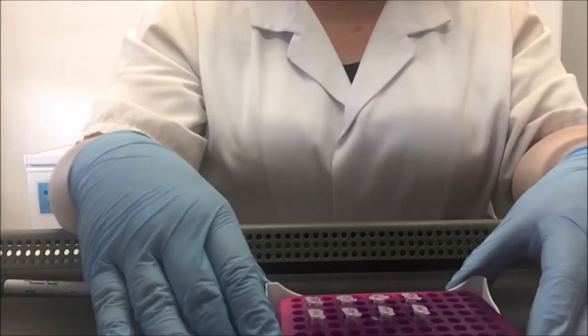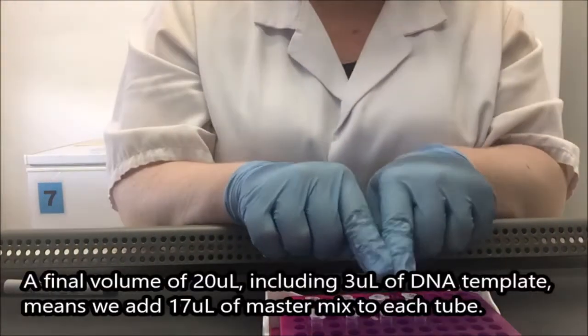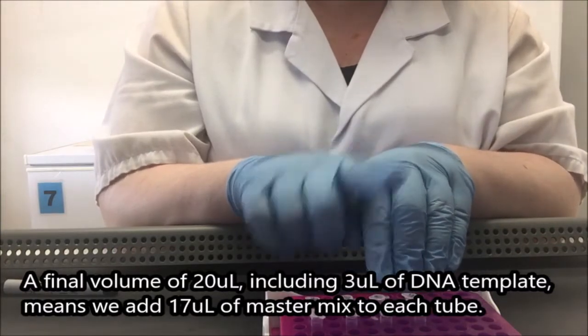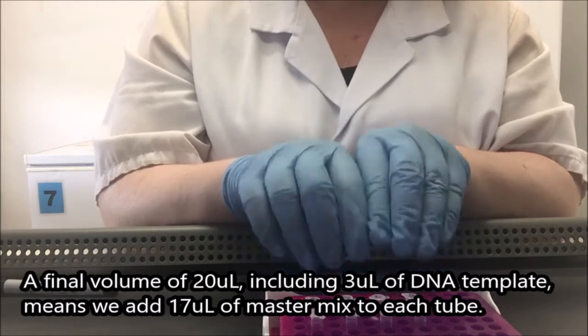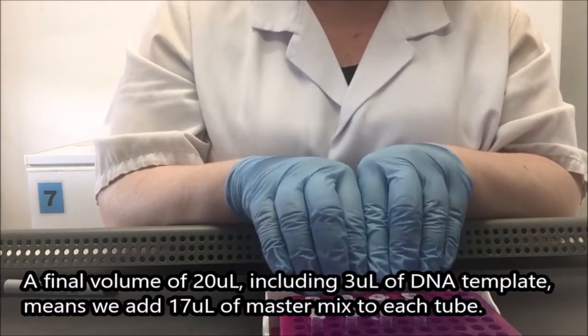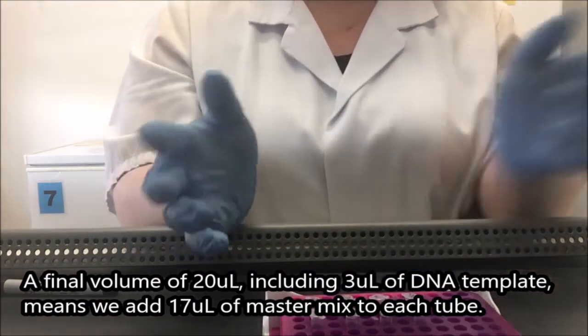And now we're back to our pre-prepared smaller tubes. And to each one of these, I want the final volume at the end to be 20 microliters. But in addition to the master mix we've prepared, I'm going to be adding 3 microliters of DNA. So I need to deduct that 3 microliters of DNA from my 20 microliters of desired volume. That gives me 17.